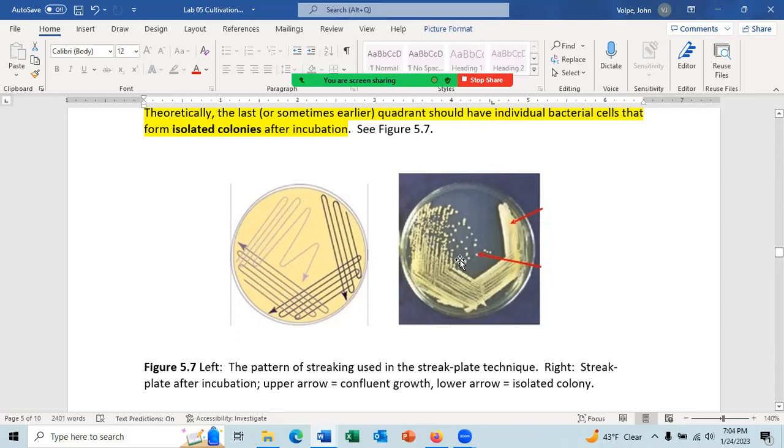Any questions about that? Remember, this is only one colony isolation event. To make sure you have a pure colony, you should pick up cells from one colony here and then streak it out on another plate for isolated colonies. And after you've got cells that went through 2 colony isolation events, you can say with greater than 95% chance that that will be a pure culture.